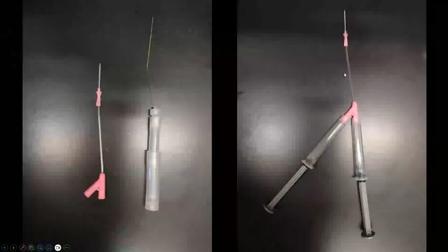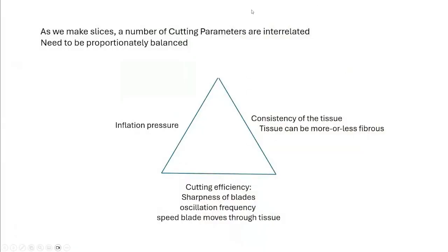I like this slide. Okay, so now we're going to make the slices, and we will cut the lung tissue out of the animal and put it into a petri dish as shown here. And this will be in Hank's balanced salt solution, so it has a chance to wash. And you might want to do a couple of media buffer changes to make sure that the solution is nice and clear and clean, and you have a nice inflated lung that has cooled.